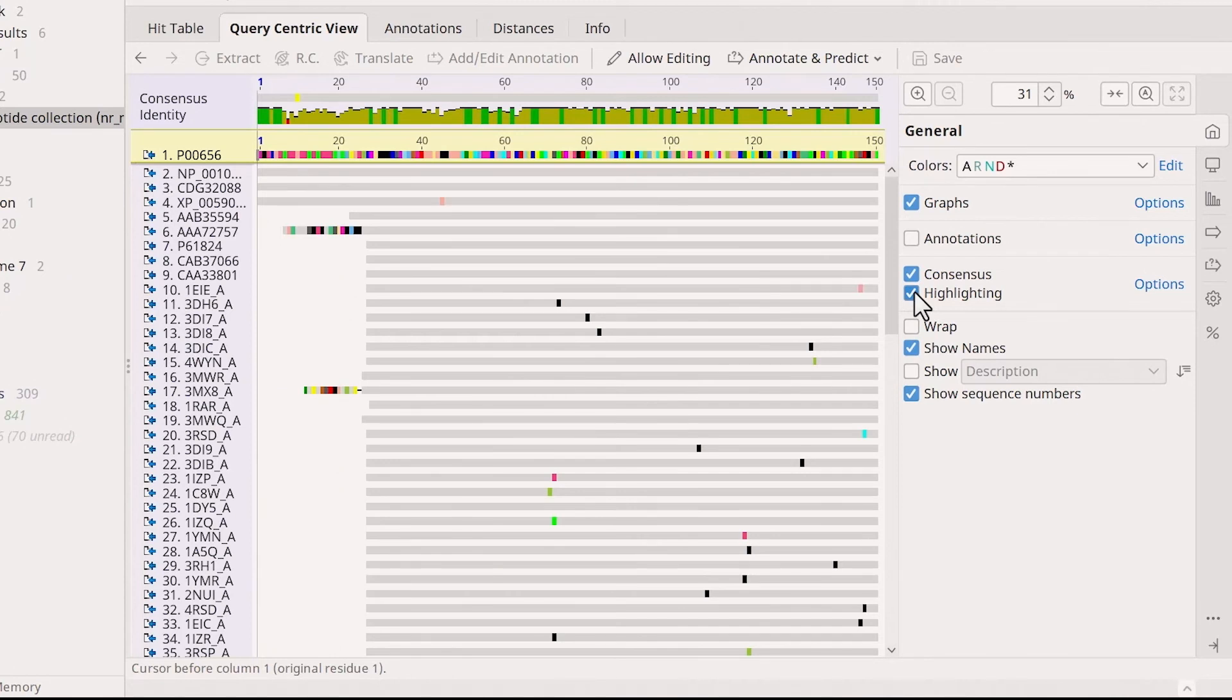This way, you can clearly see how similar the hits are to the query, with top hits being most identical to the query, and similarity decreases as you scroll down.